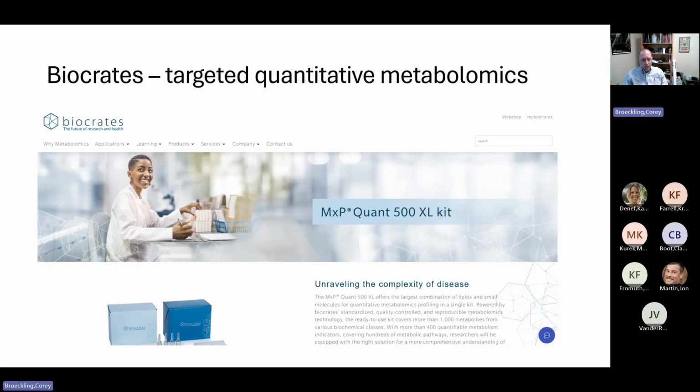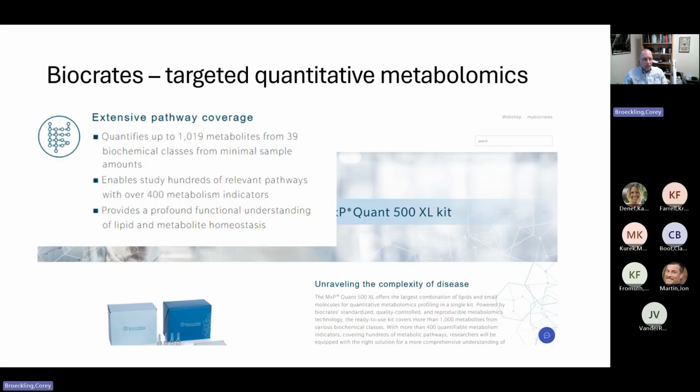But there's some opportunity to adapt it. And basically what it is is a sample preparation kit that comes with columns and methods and internal standards and processing software. And so you prepare your samples, often in a plate-based format, and then we acquire data on our LC tandem quadrupole system, and that data is uploaded to their software for data processing and analysis visualization.